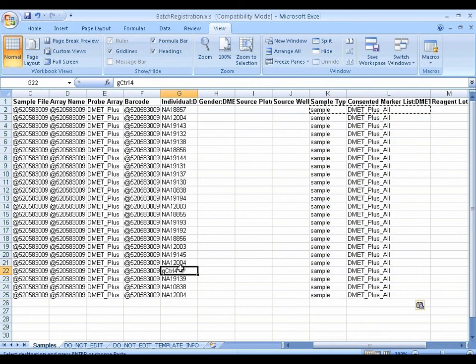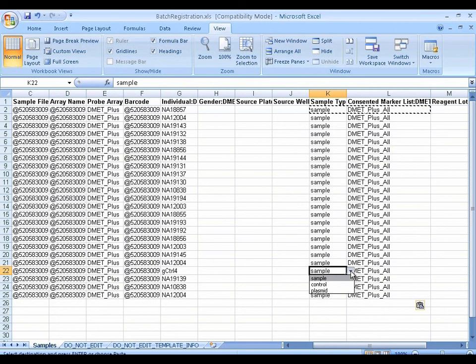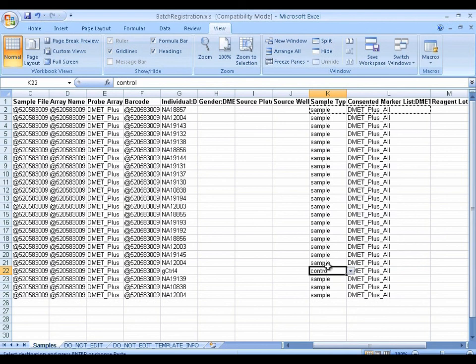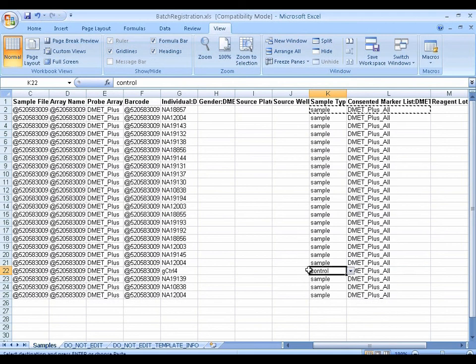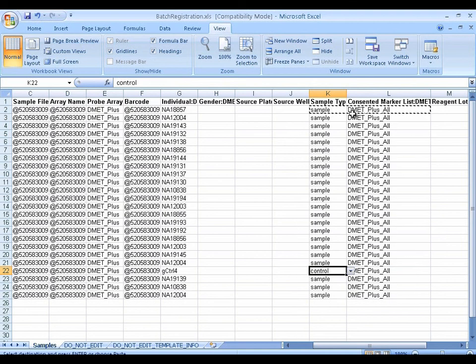And one sample that is being called a genomic control. Let's just call that a control. It doesn't affect how the data is genotyped as long as it's genomic DNA. But it does allow, in cluster plots, color coding some of the data points as controls versus samples. So this is certainly optional. But it is definitely required to fill in some sample type and some consented marker list.